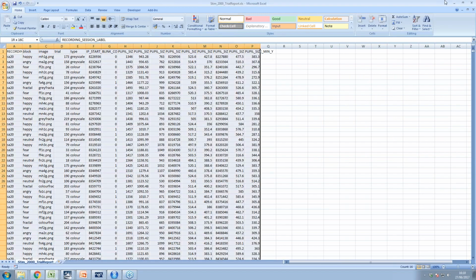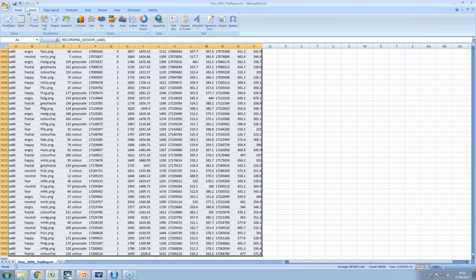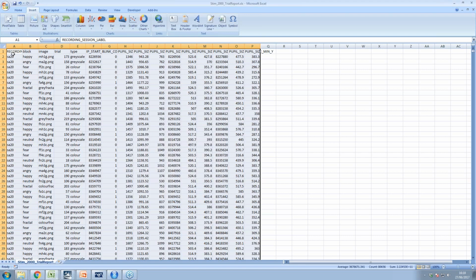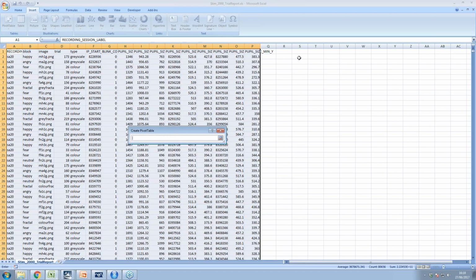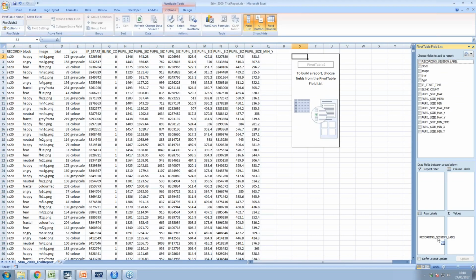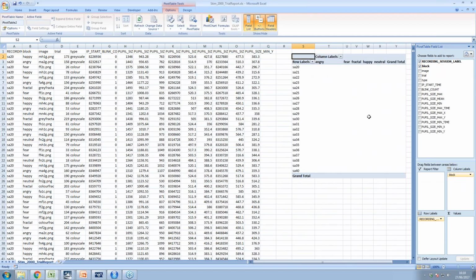We can do the same thing again. Select all the data. You can see we have the same number of rows as before. Insert a pivot table somewhere over here on the right. Made a mistake. Insert pivot table on the existing sheet. Okay, so again, we can put in our participants as rows, our block, condition if you like, as columns, and we can start exploring.